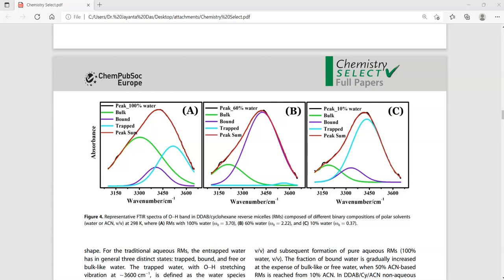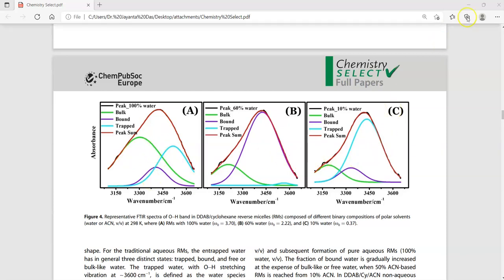This is one reputed paper, Chemistry Selects of John Wiley. Here, authors have utilized the Origin software to deconvolute the spectra of water. We can see that this broad band could be deconvoluted and interpreted as an assembly of three peaks. This is one example.